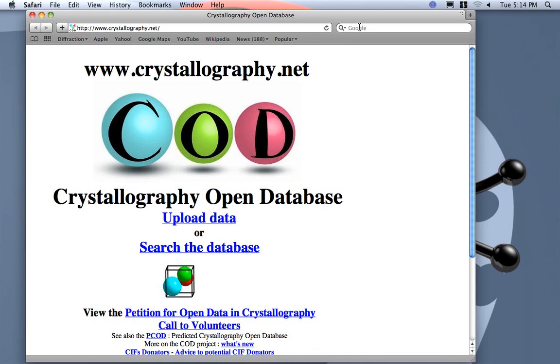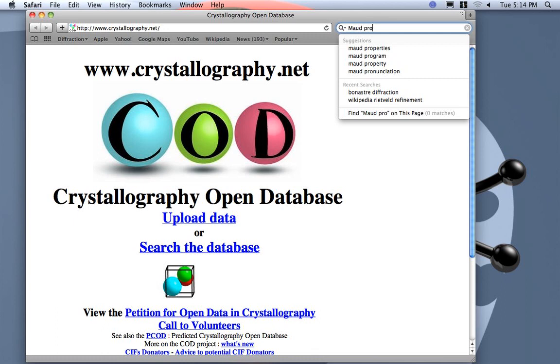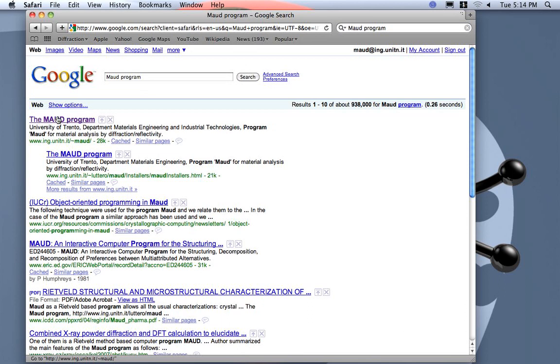First we go to download the program. You just search on Google for example Maud Program, and here is the first link at the University of Trento where my web page is.